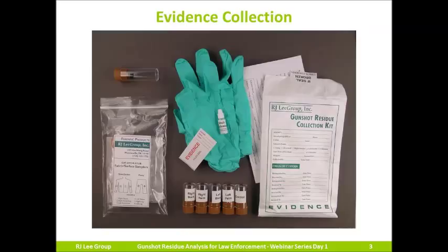If you're ever in a pinch and do not have access to a GSR SEM kit, do not use a Q-tip or swab. At the very, very least, use a small amount of packing tape. However, if you have clothing or another item in-house for collection and are in need of a kit, give us a call and we'll quickly give you one free of charge.